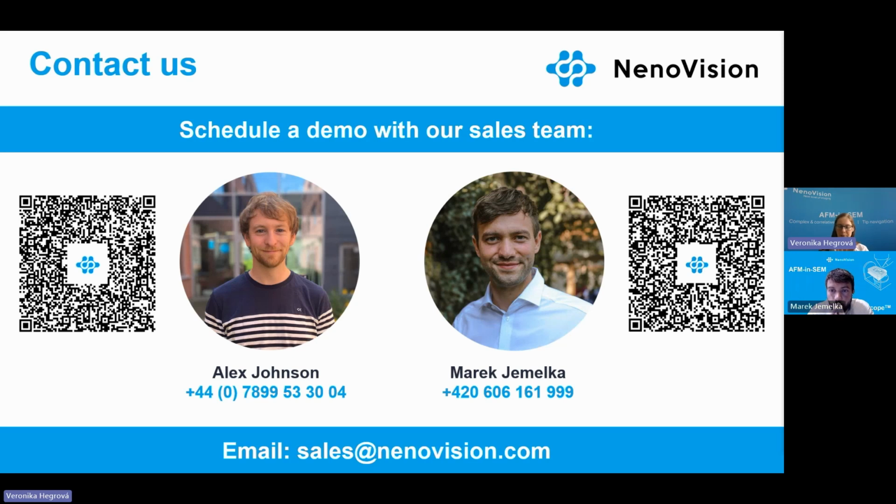We have more and more questions coming in. That's great, guys. Thank you. We have a question from Ladislav. Are you limited with the maximum depth during the PFIB delayering, so the cantilever could still fit in? Yes, you're correct. And here I actually don't know the exact number. As the probe tip height, it was within several micrometers.